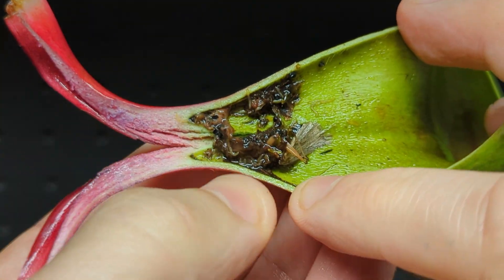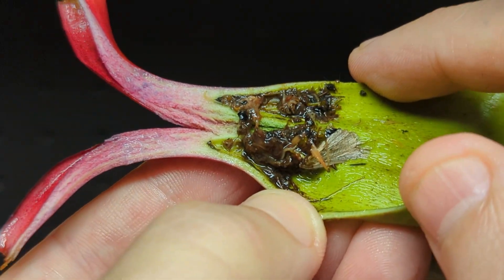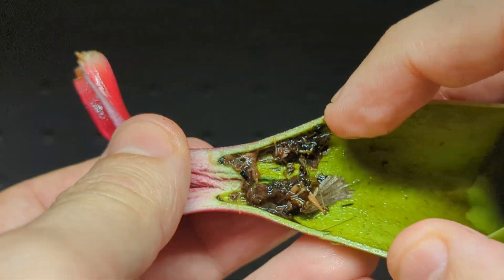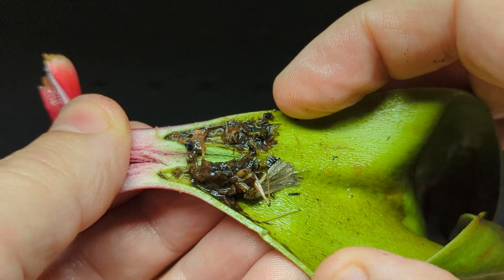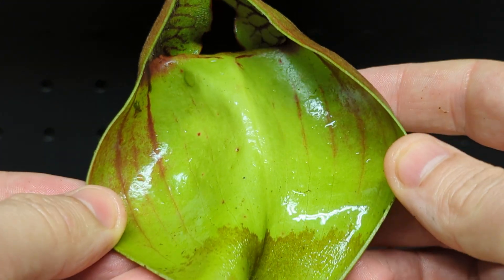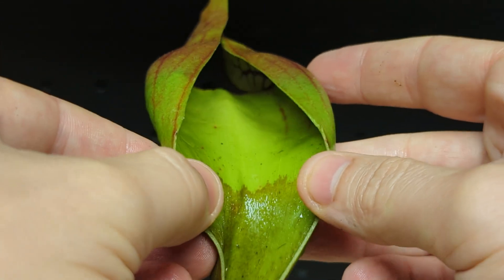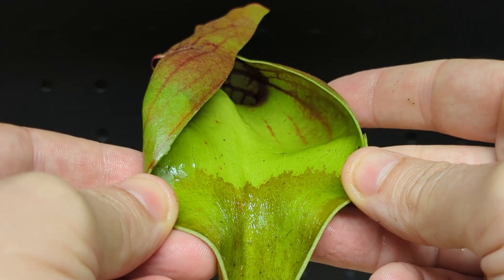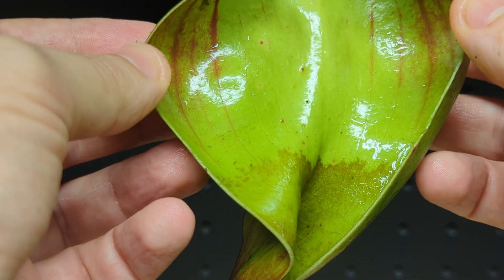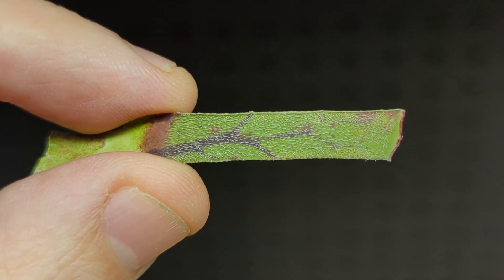So here's my question: what do you think these hairs are for? By the time an insect gets to them, they can't be for trapping and killing, because the insect has already drowned. The water is almost up at the lip, the walls are too slippery to climb, so bugs drown at the surface. So what are those hairs actually for? Let's look at them under the microscope.